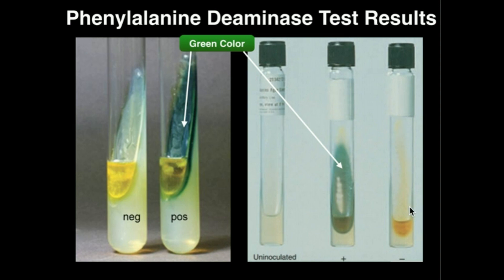Over here on the far right in this picture, this is a negative result. Over in the middle, we have a positive result because we have this dark greenish color. So that's how you identify the results for a phenylalanine deaminase test, and hopefully the theory behind that made a little bit of sense. Thank you.